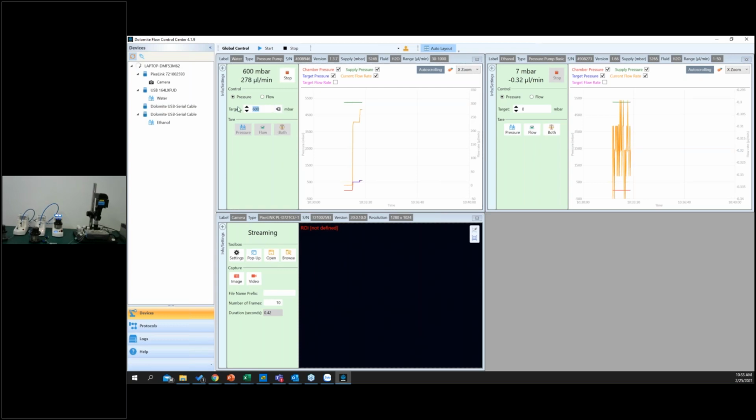So how about maybe 1500? It's the higher gap between the pressure, so you can get a very quick response from this one. It's a kind of advantage of the pressure pump, so you can very quickly change your parameter using the pressure controller.